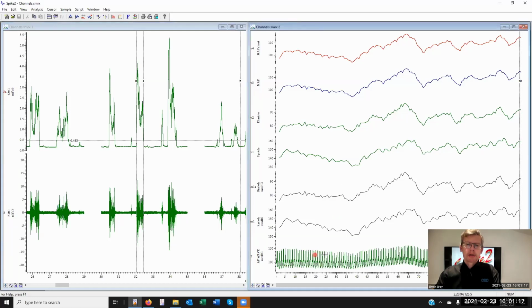I have blood pressure at the bottom, and above that, I've created various channels to ultimately end up with mean arterial pressure. Now this could be produced online or offline. Above that, again produced online or offline, there's a shortened version. I'll explain more about that in a second. So another mean arterial pressure, but a short step to get to this point.